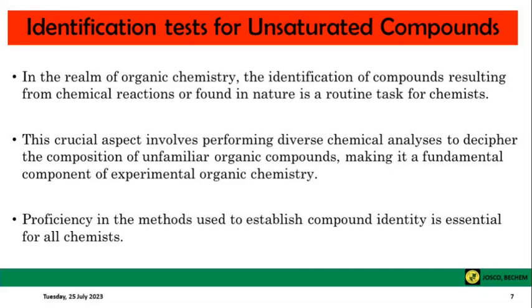In performing chemical analysis, in order to identify the composition of organic compounds that are unknown to you, you need to have a fundamental basis in terms of concept of how experimental organic chemistry is. That is, you need to know the kind of method that might be used in order to establish the identity of a compound.